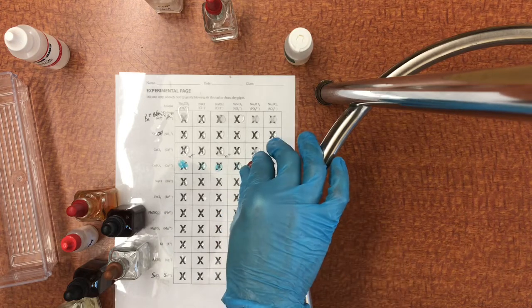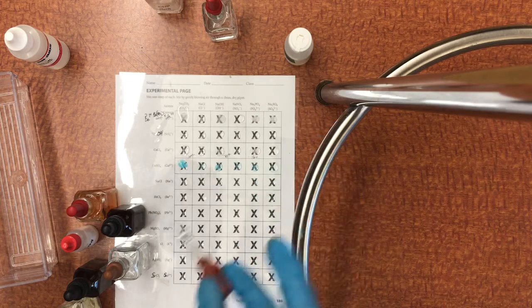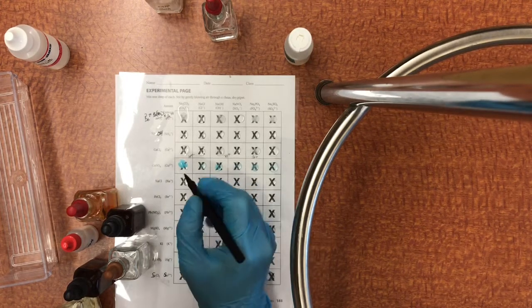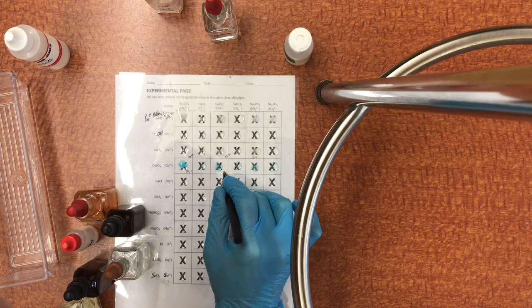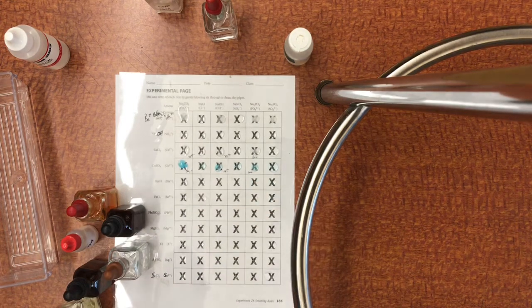No reaction there. There is a reaction there, and I believe that sulfate should be okay because this is copper sulfate. So when we mix copper and sulfate, we get no reaction. So we could also go in, it might be worth writing PPT. Oh, just got on my pen. And PPT. Okay. So hopefully that should agree with any expectations we had before we started the experiment.